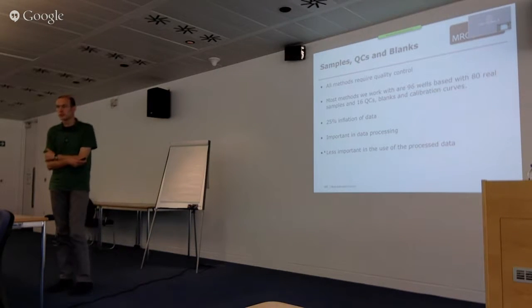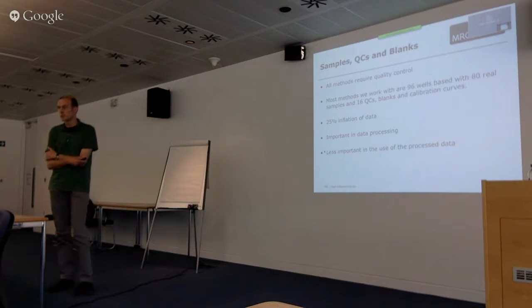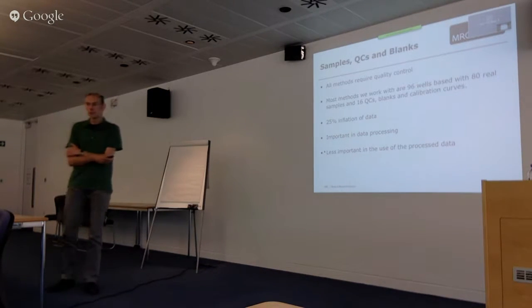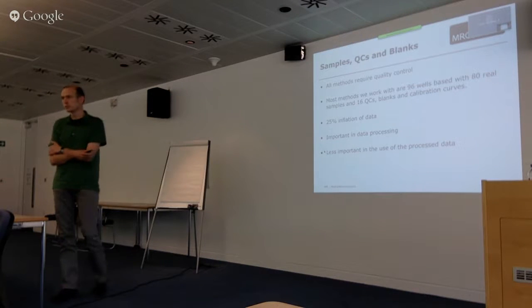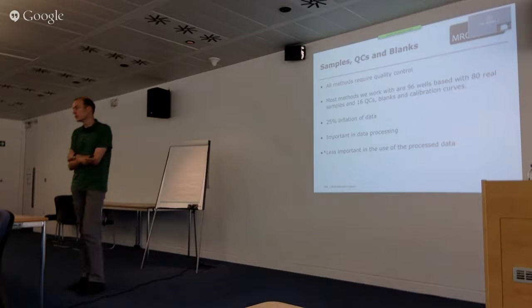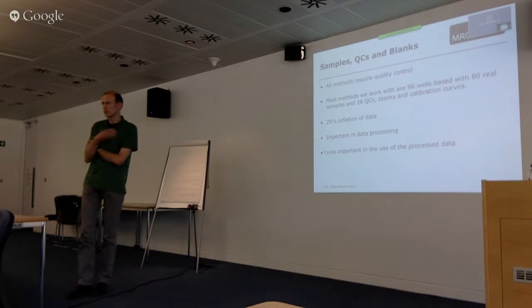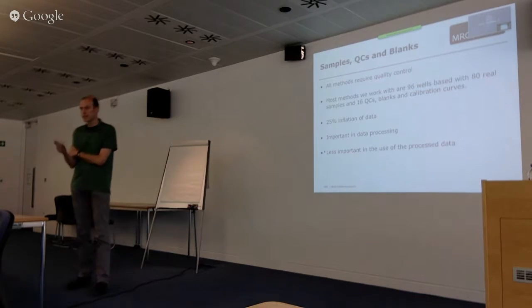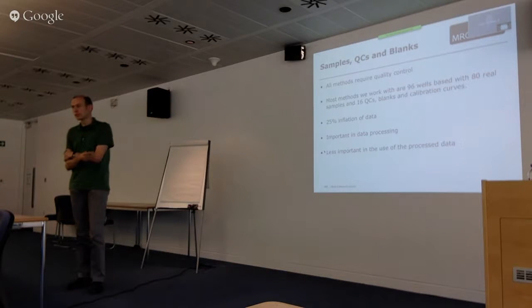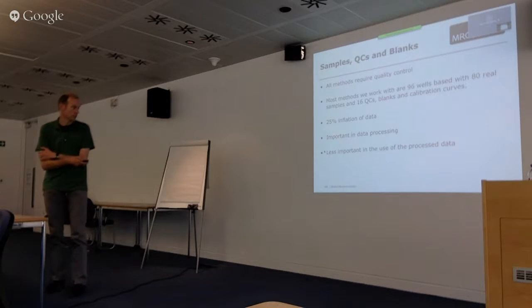About 25% of the data we produce is actually just quality control and blank data, which for the end users is not that interesting, but for people who are interested in mining the data, it is crucial to be able to see which signals are real signals and which ones are background.